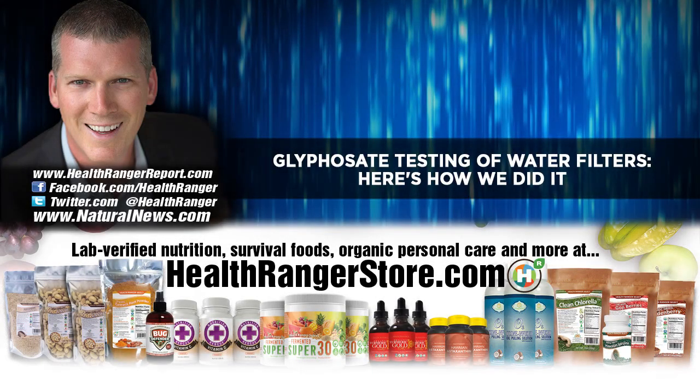Hey, I want to thank you for all the positive feedback surrounding our glyphosate testing of water filters. We put the results out there on naturalnews.com and glyphosate.news. We did mass spec testing of water filters, popular filters, water pitchers and sports bottles and gravity filters to see how much glyphosate they would remove.